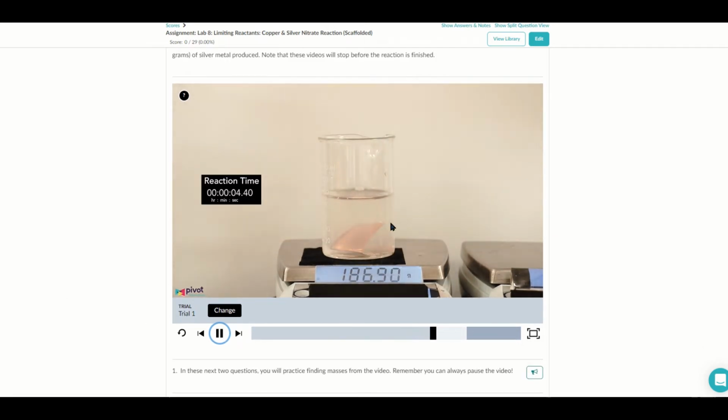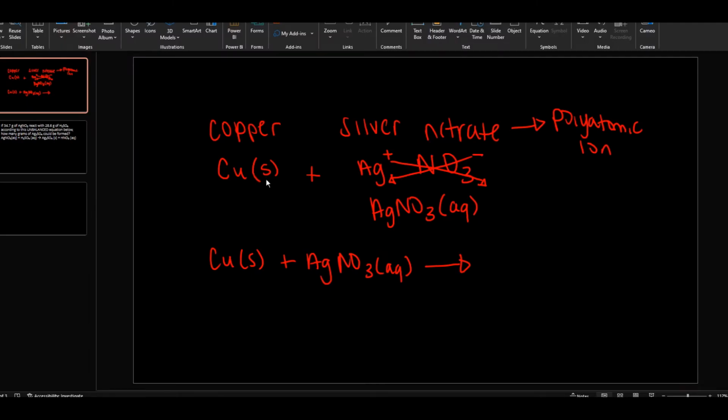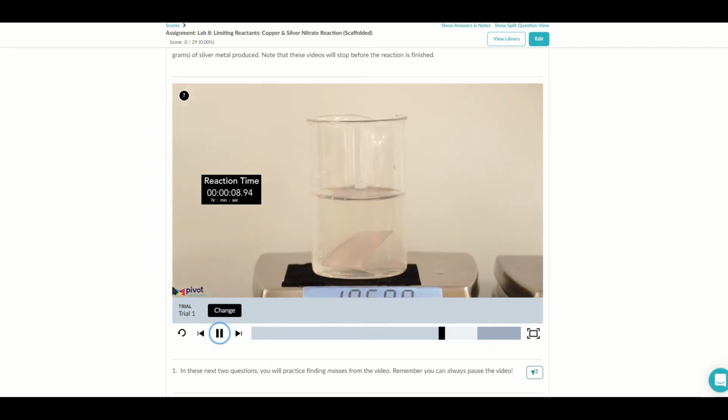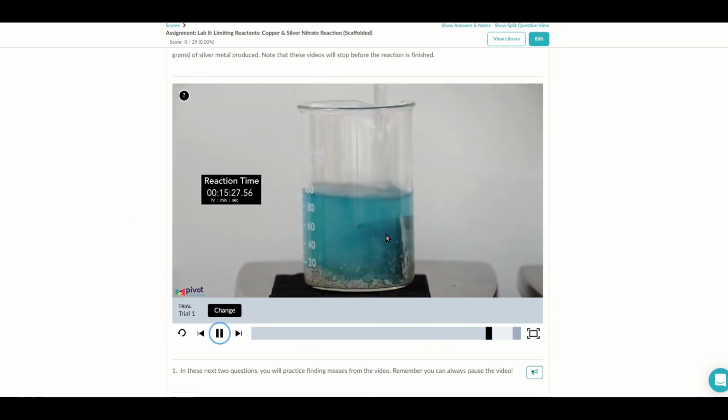And then there's a piece of copper. It's solid. So like we said, once again, it's solid copper. Now, sorry for flipping back so much, but hopefully that helps make the point. Now we can see that the reaction is happening over time, and you can see that the copper is looking a little bit funky. But what's actually happening is that solid silver is forming.